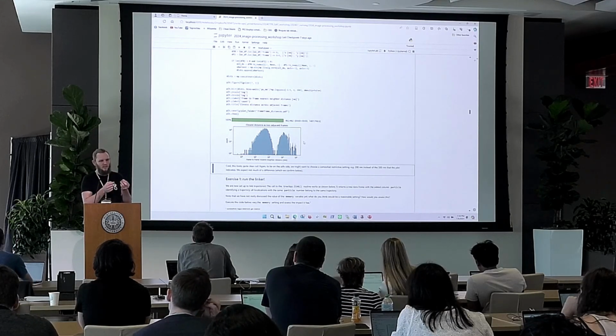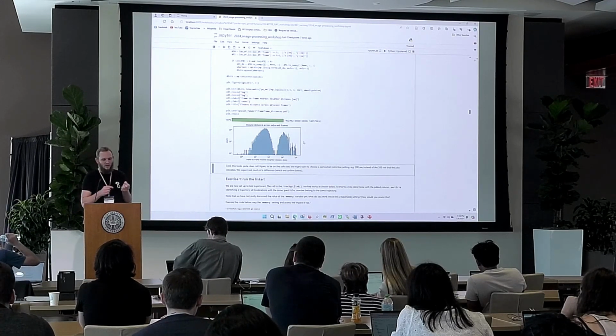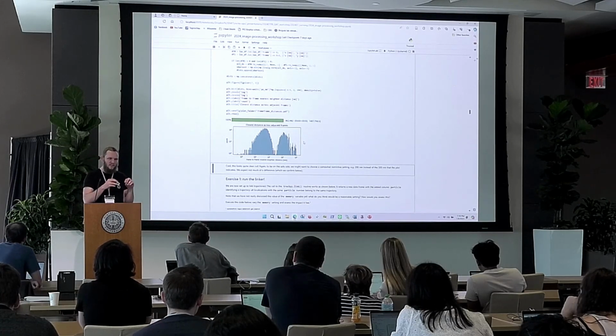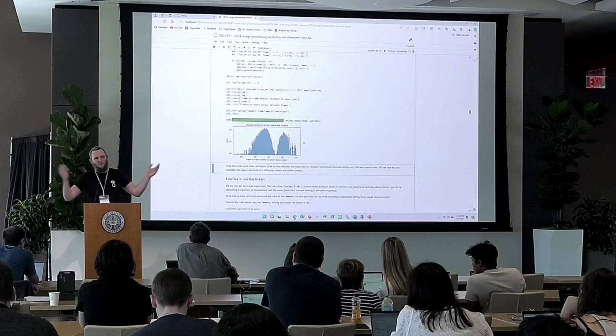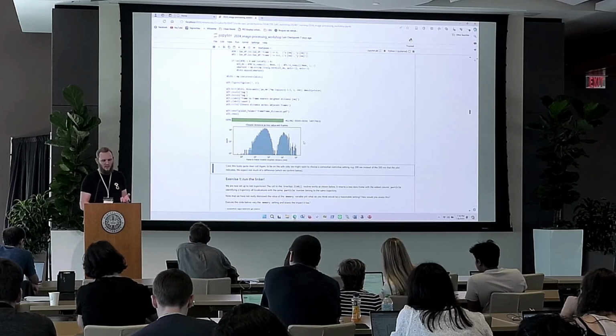So the closest distance from the localization in the first frame will pick up the one very close by. That's this first hump. The second hump is the situations where we don't have the same particle in the next frame, and then the closest distance from the localization in the first frame goes to some random particle, reasonably close by, but not as close as it would be if it was actually the same particle.